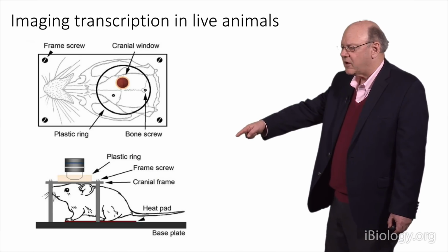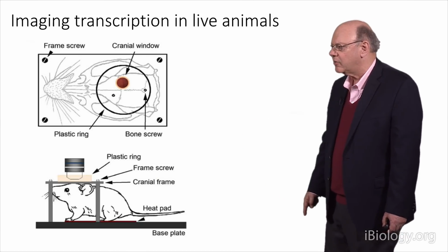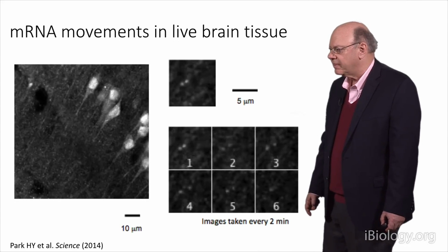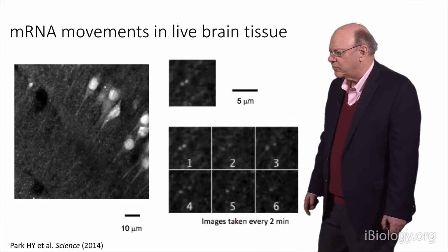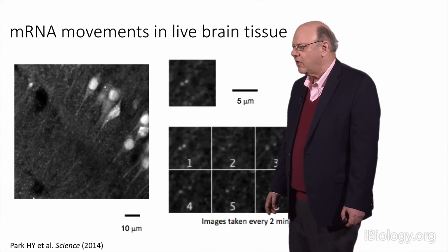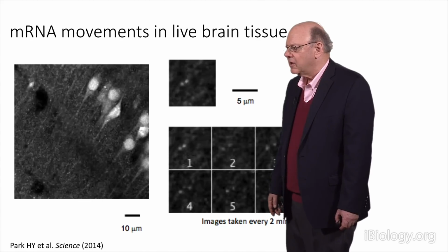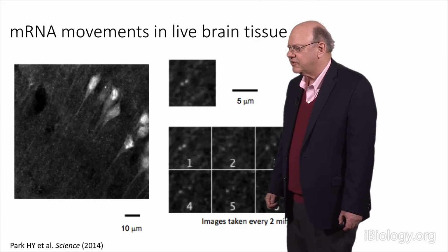And that whole process can now be followed in neurons with some additional technology that would require long working distance objectives and adaptive optics and other processes which allow us to see inside tissue.